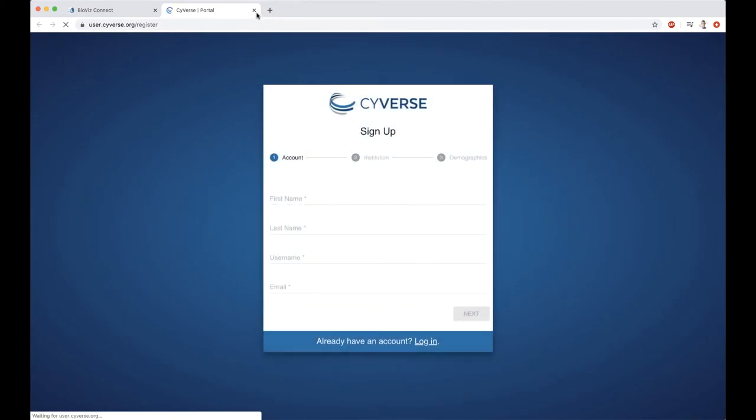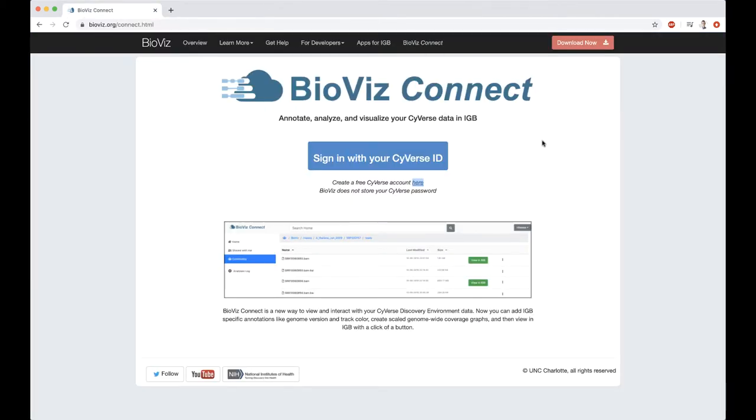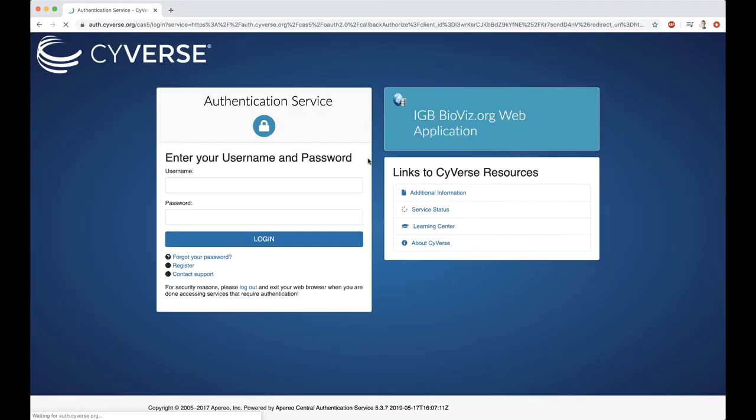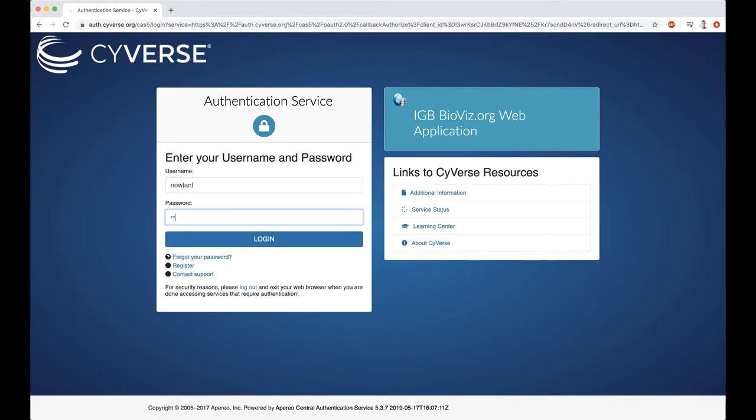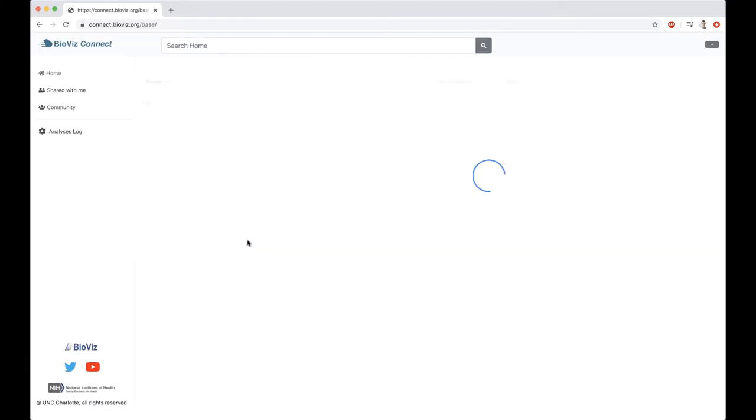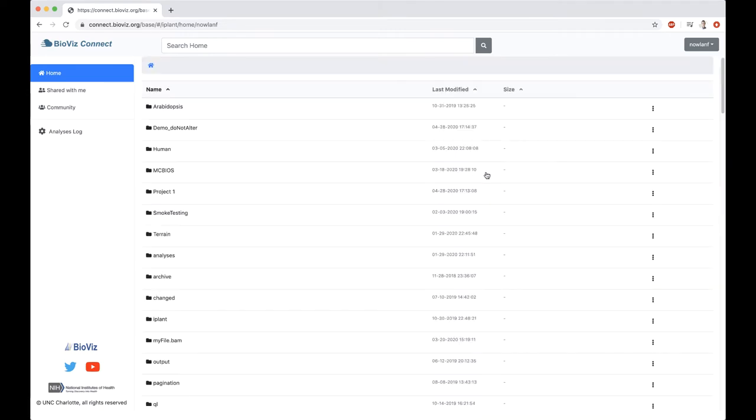The Cyverse accounts are separate from BioViz. We don't see your password, we don't have anything to do with the account itself. When you click on this button to sign in, you're going to use your Cyverse credentials that you've created. We don't have access to your Cyverse password, and you don't need a separate BioViz account. Once you've made your Cyverse account, or if you already have one, that's all you'll need to log in.